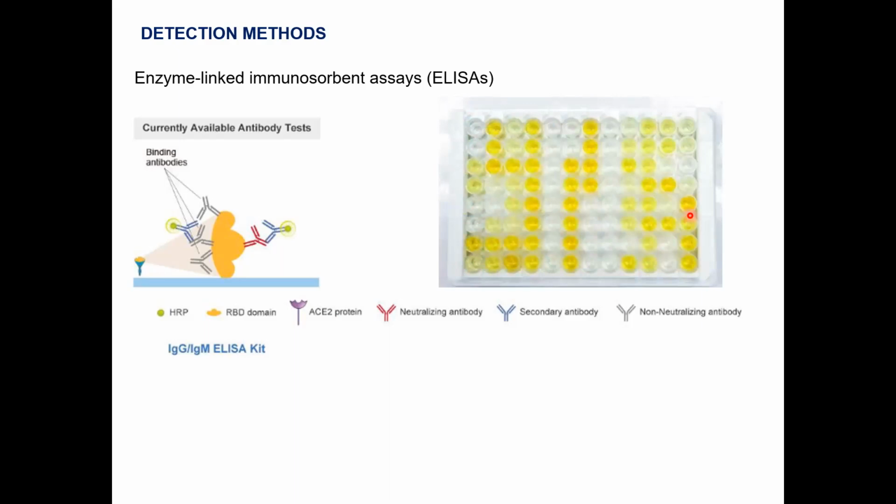In that case, we are using an acidic solution, which gives you this yellow color, and now it is stable for 2-3 hours. And then you can measure the absorbances of this one. Based on the manual of the ELISA, it can be 2 or 3 different wavelengths that you need to measure the absorbance of these wells.